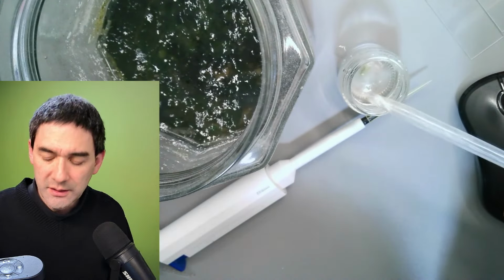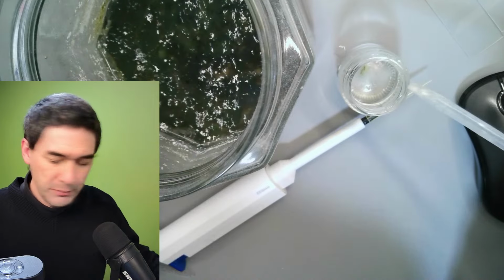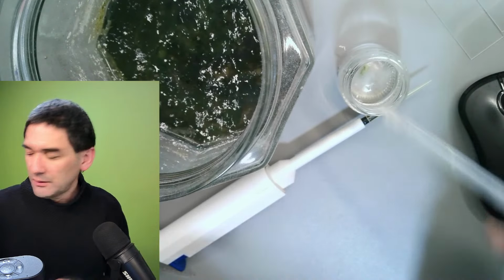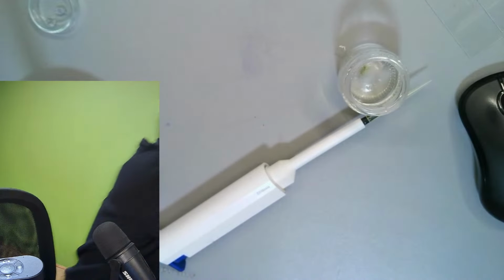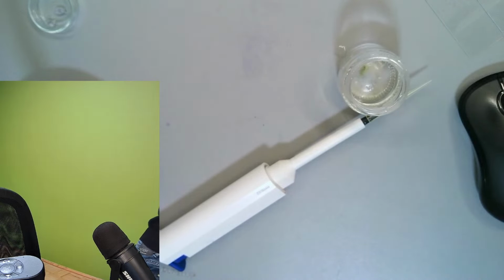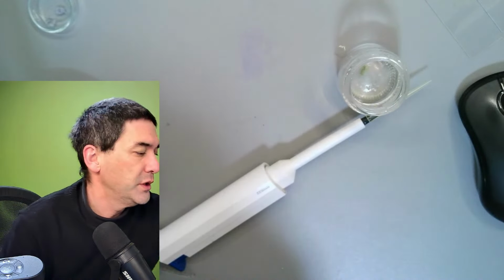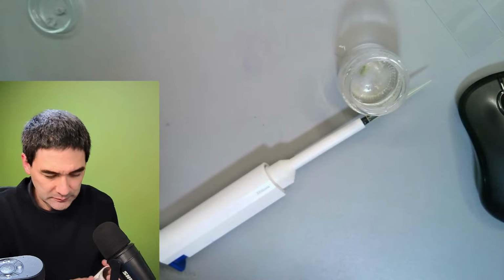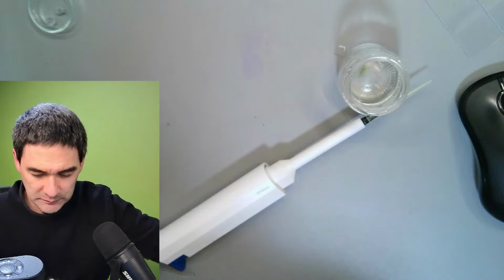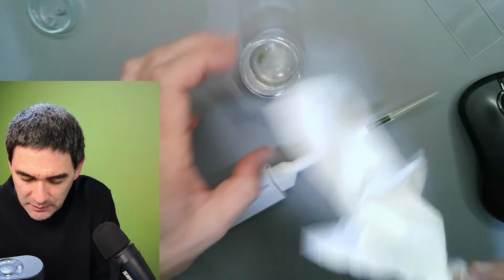So this is kind of disgusting now. What I'm going to do with that, I need to rinse it or throw it away. I'm just going to put it somewhere because I don't want this to make any mess. So I'll put the jar away. And then I need some more tissue paper to wipe up the mess here. So, and then I'm going to wipe this here as well.